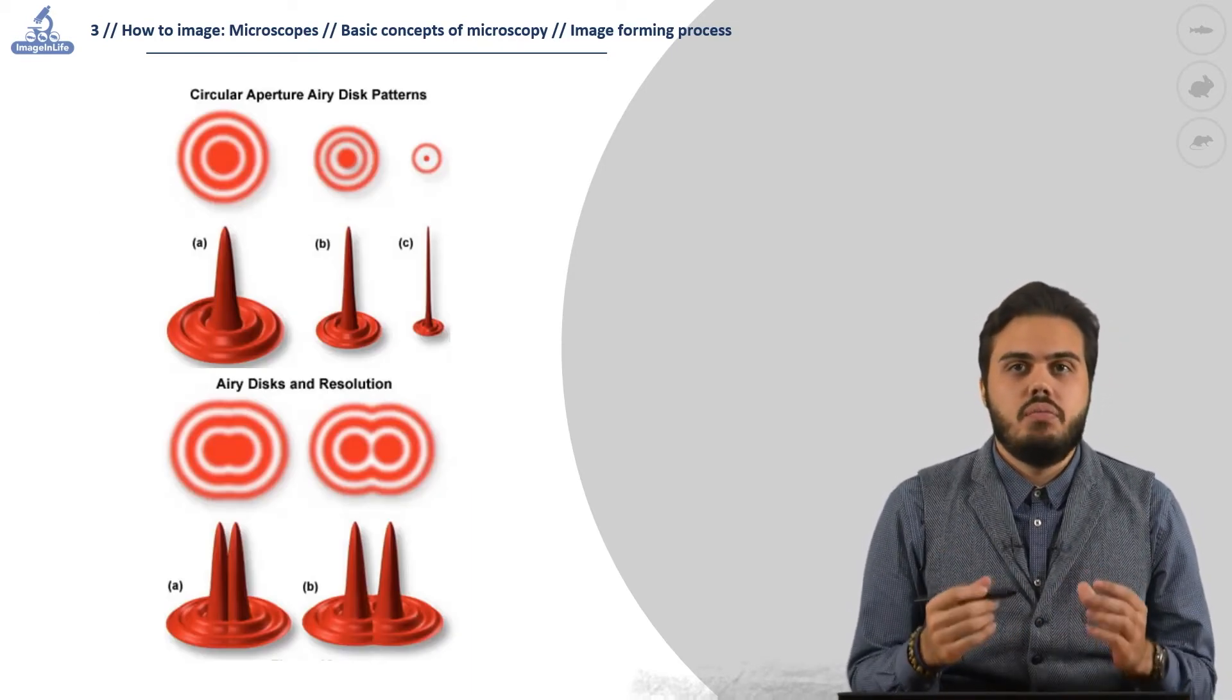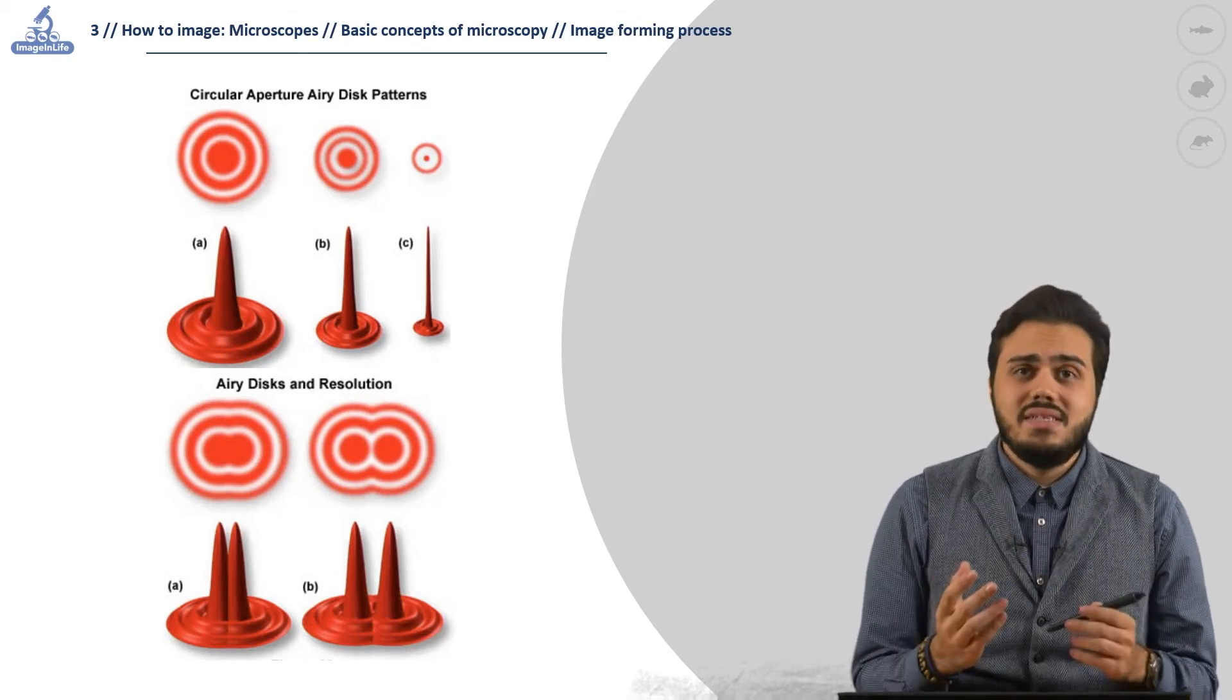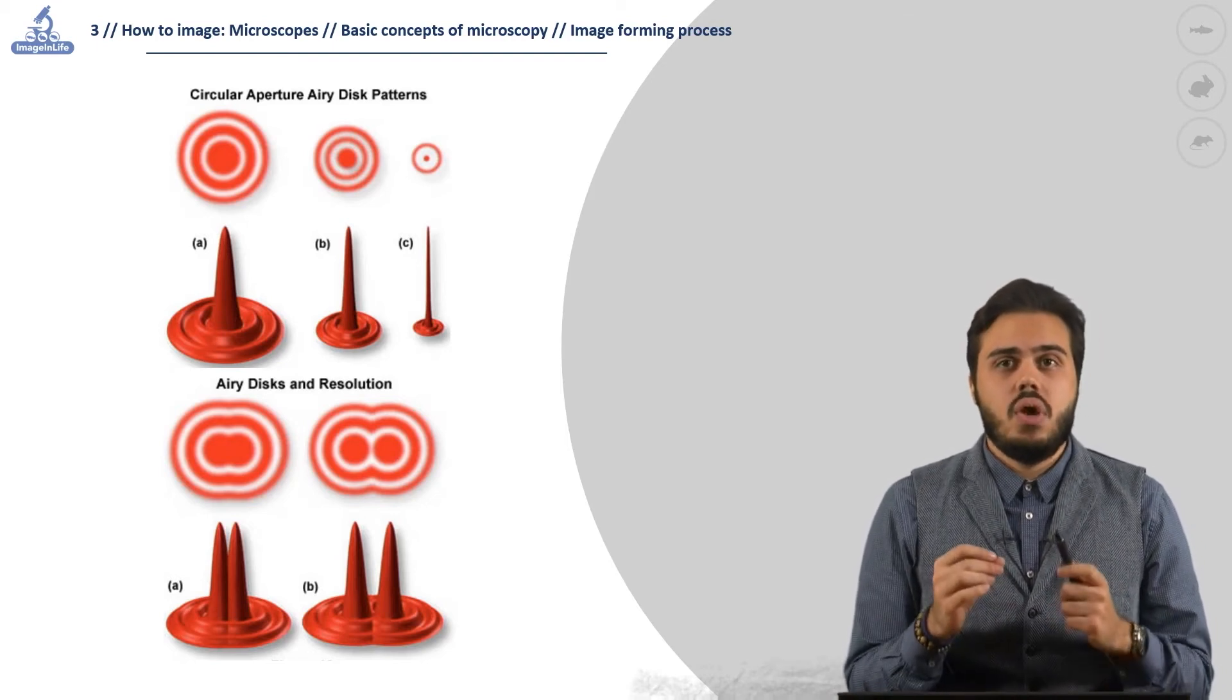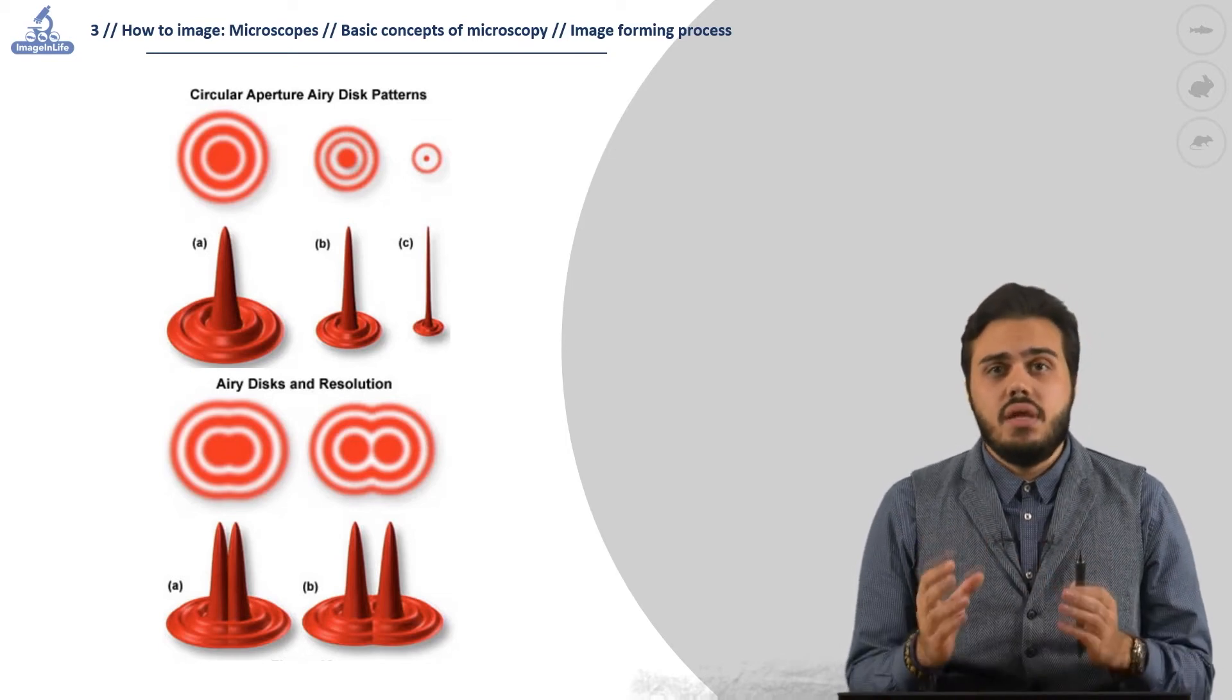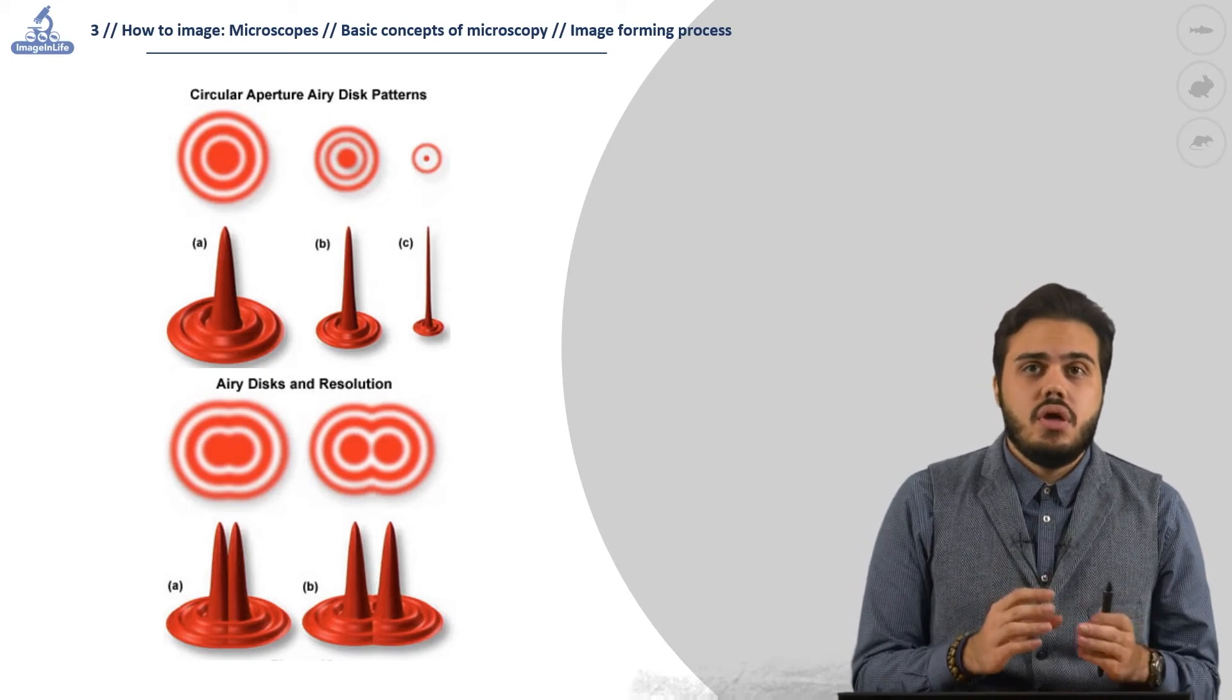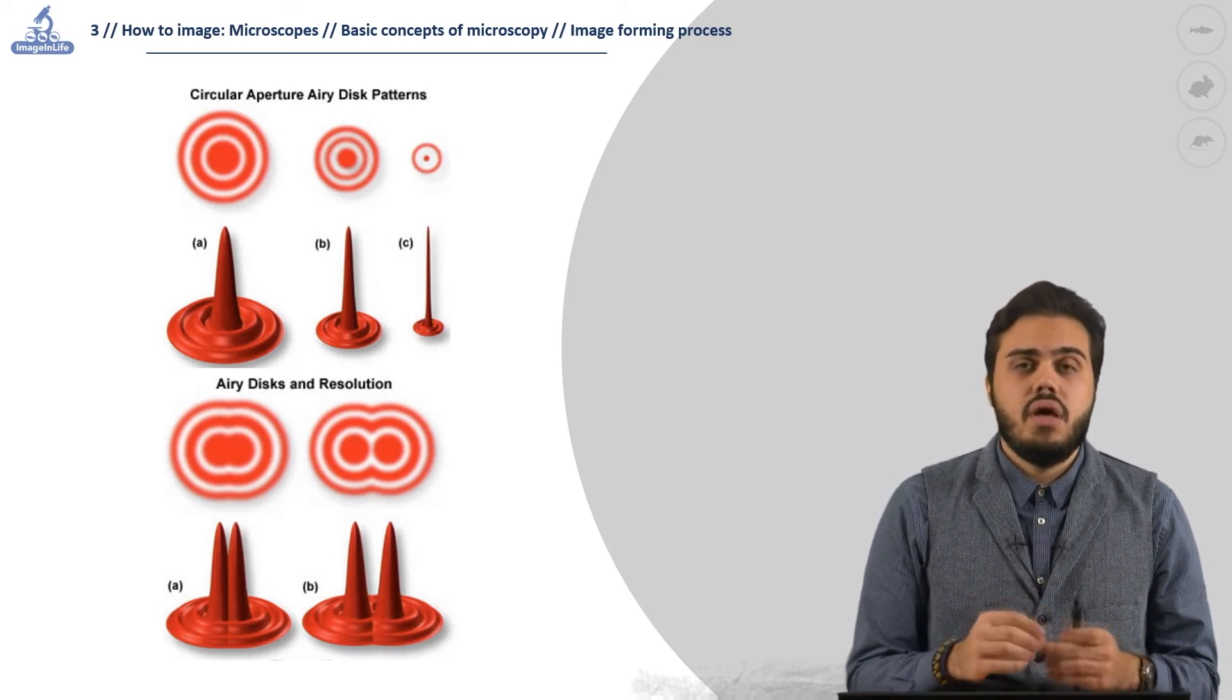From these diffraction patterns, how do we form the final image? The lenses in the microscope have the important role to determine the quantity of light passing through the condenser, as special lenses, that later will be transformed in a matrix of dots.